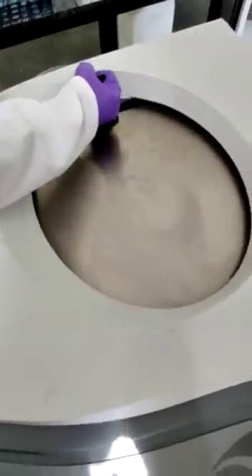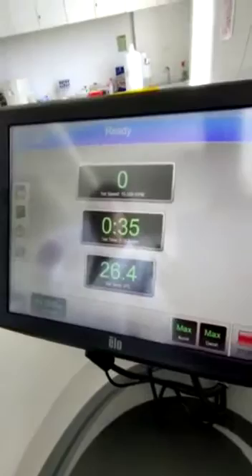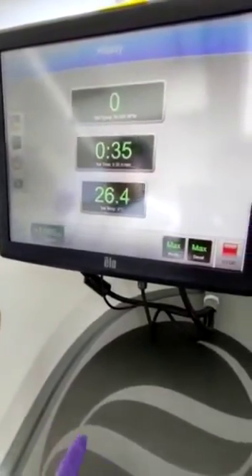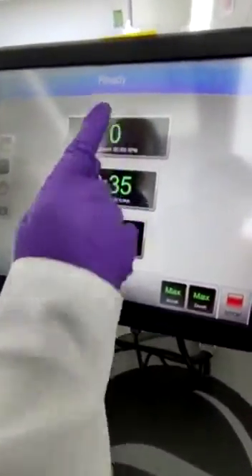The instrument spins the sample under vacuum at a set temperature and speed of up to 60,000 rpm, measuring the optical density or refractive index along the cell radius over time to provide insight into the particle configuration, structure, stability, and interaction with other biomolecules.